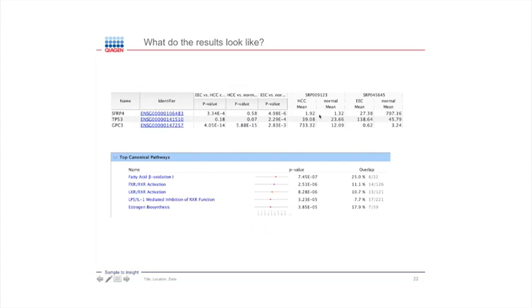And you can see the average expression in the 3 HCC samples, in the 3 HCC normal samples, in the 3 EEC samples, and in the 3 EEC normal samples. And the first gene is known to be present in EEC, and we detect that. It's not present in HCC, so it makes it into this list of significant genes that are different between the two cancers.